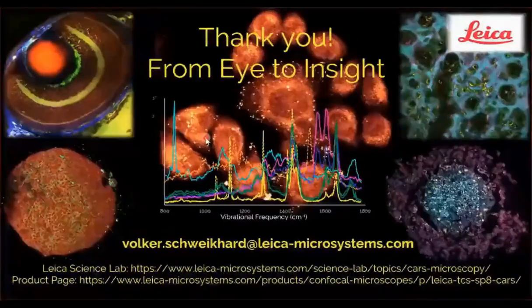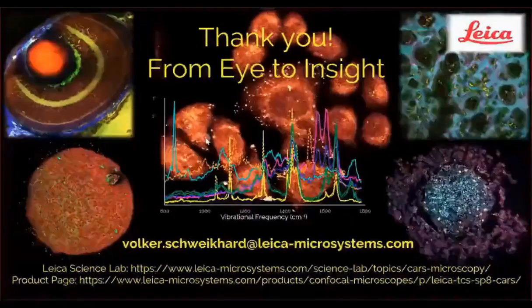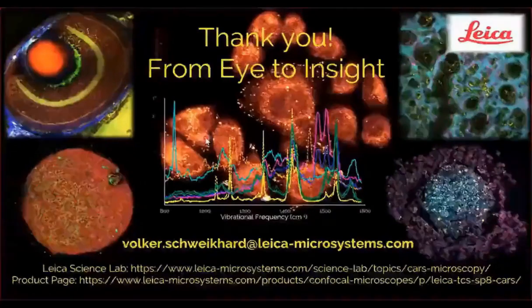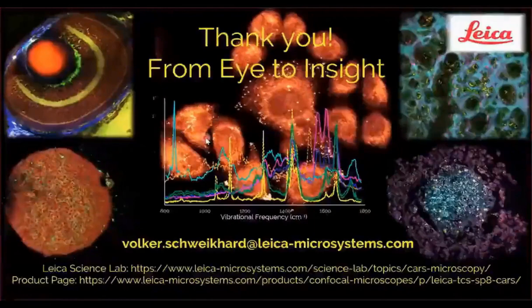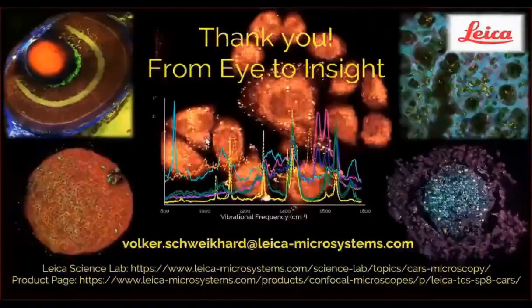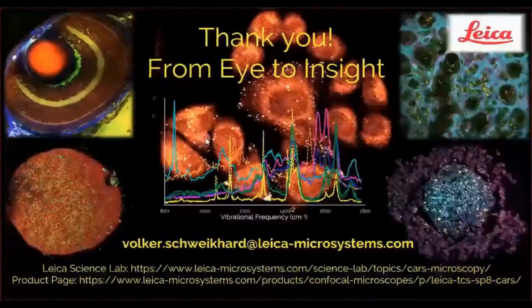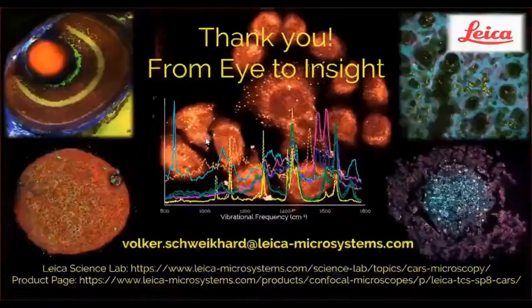Our first question: how does the duration and composition of chemical fixation affect SRS imaging specificity and sensitivity? Okay, that's a great question. We haven't explored this in detail yet. What we have made our rule is to allow formalin fixation. We have never seen any major effects of formalin fixation on the kinds of SRS signals and coherent Raman signals that we get.